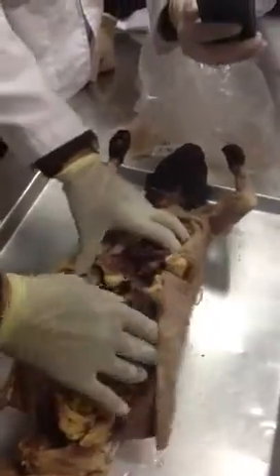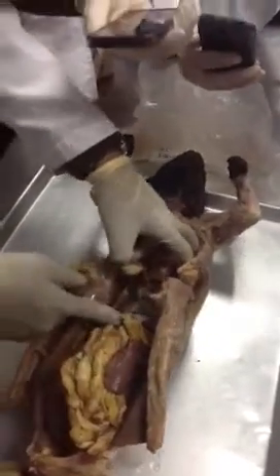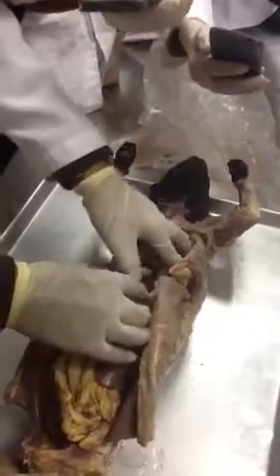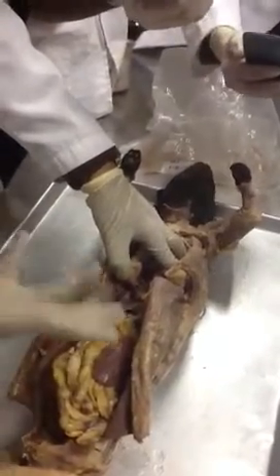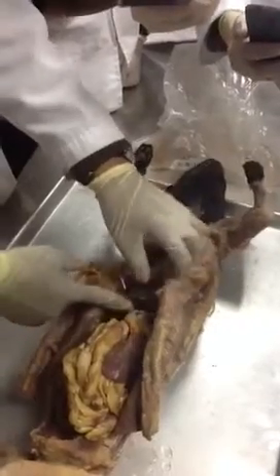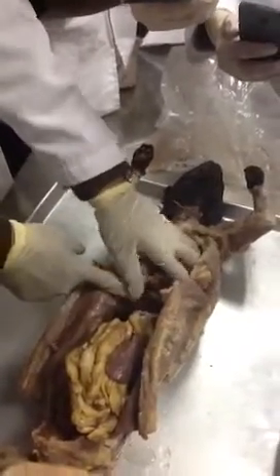Now let's go down and see what's going on here. This is the liver, right? Unlike human beings, cats have segmented livers. Most of you have seen it in pigs too, they have segmented livers like this. It is below the diaphragm.